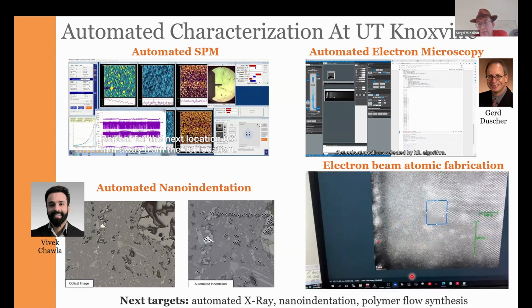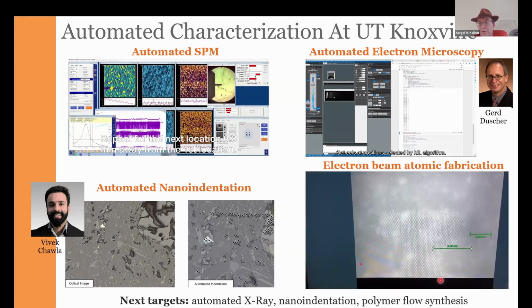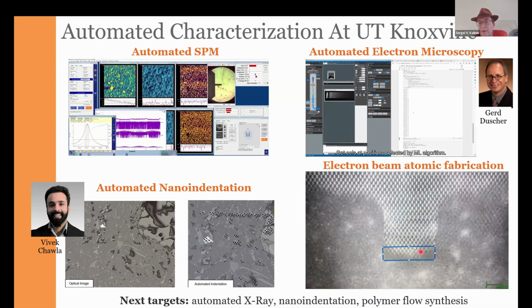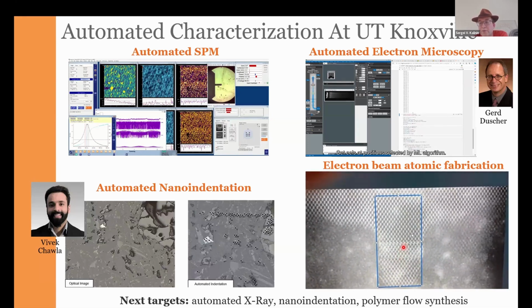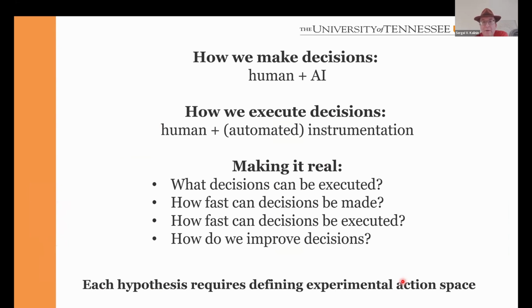So this is the example of essentially atomic scale 3D printing, when we have the amorphous silicon deposited on the crystalline silicon, and then we use the electron beam in order to crystallize it. So you see how the operator starts to crystallize the silicon from amorphous to the crystalline phase, and essentially creating the structure one atomic plane at a time.